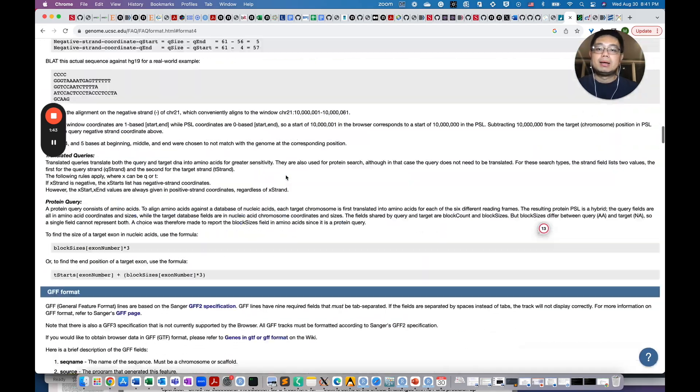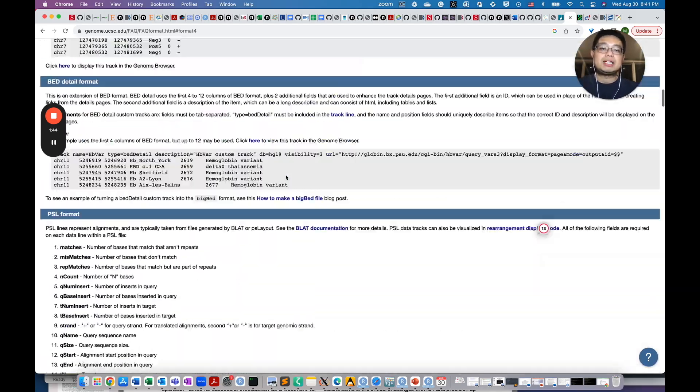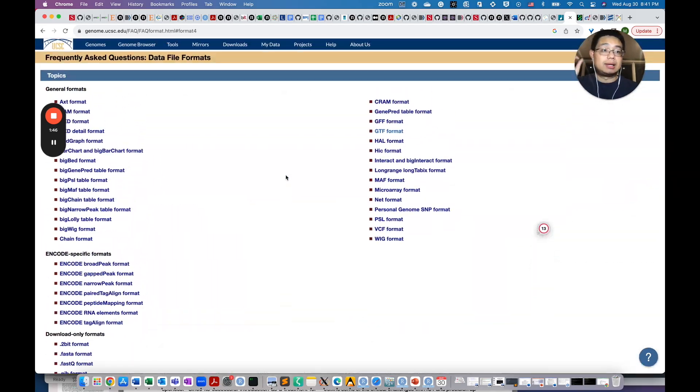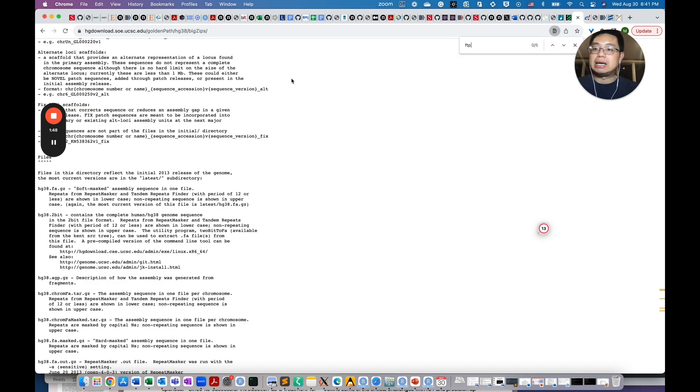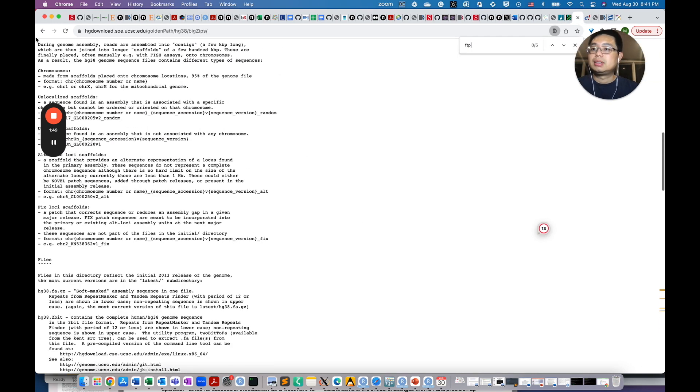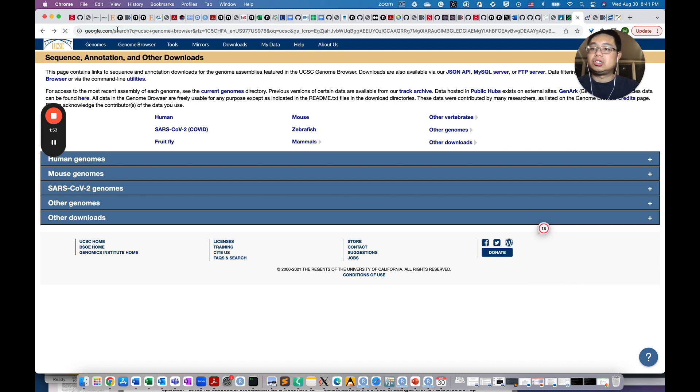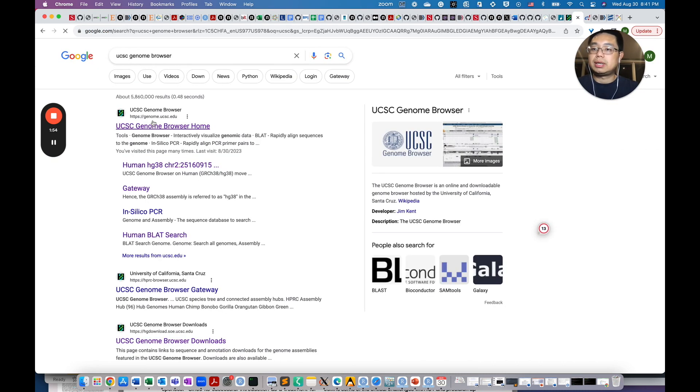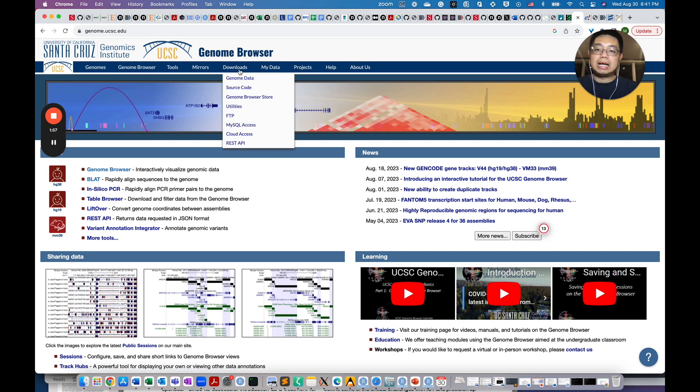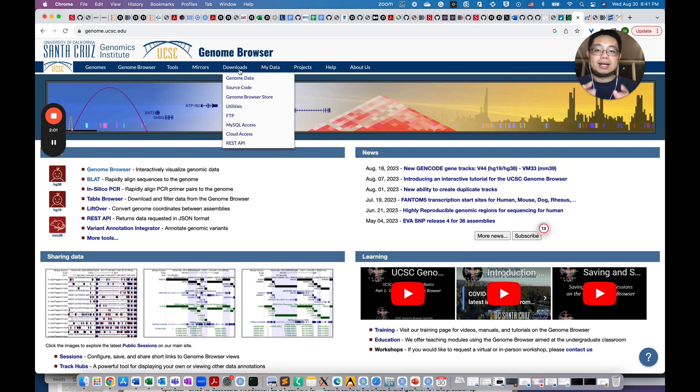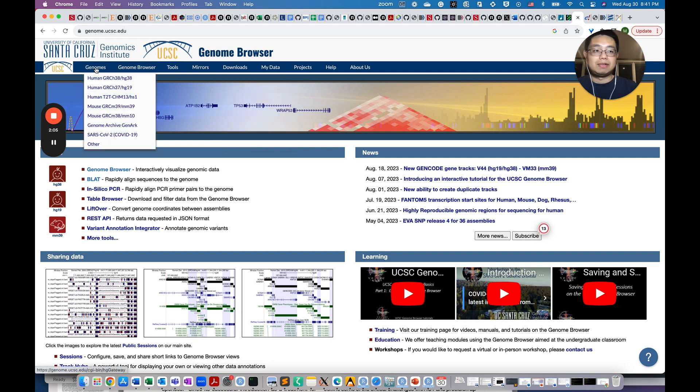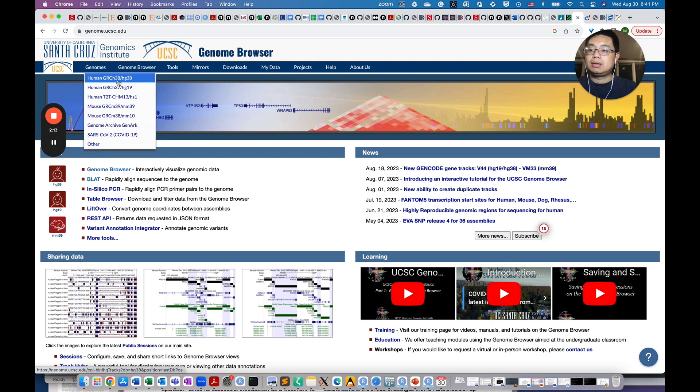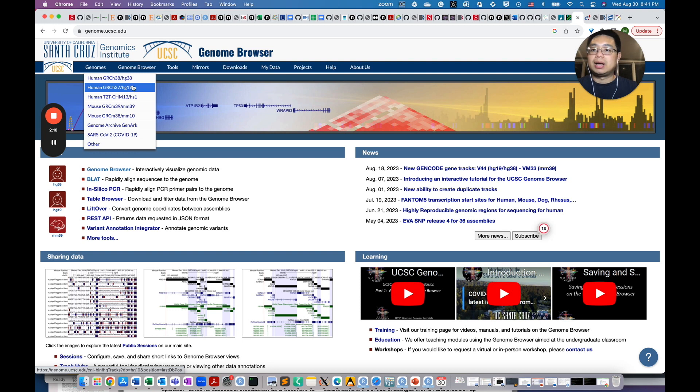The first place you can get those reference files is UCSC Genome Browser. You can go to UCSC Genome Browser, Google, and go here, and then you can go to download and download those genome data. But before we go and download those data, there's something I want to mention, the nuance of different versions of genome. For example, for human, you have the GRCh37 and also the 38 version, and they are corresponding to HG19 or HG38.